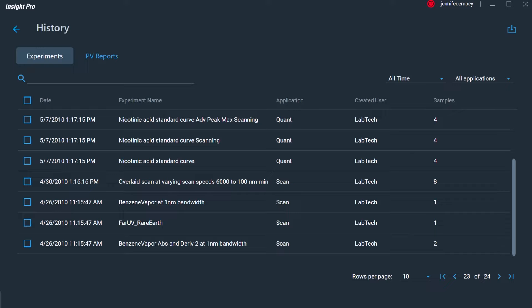The ability to restrict access to applications and features within the Insight Pro software, require signatures and record logs for audit purposes, are included in the Security Suite software compatible with Insight Pro, further complying with 21 CFR Part 11.